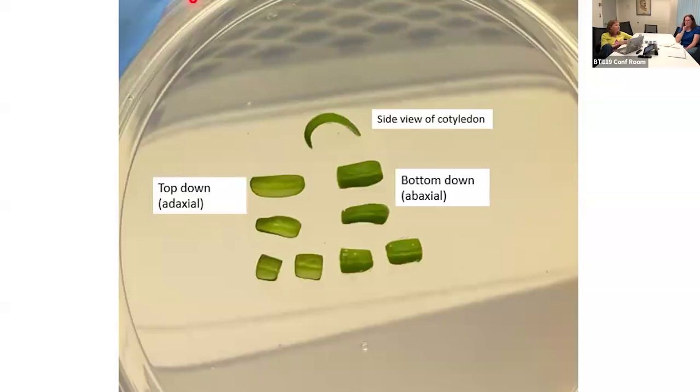One of the questions that got sent in had to do with blot drying the explants. I just wanted to mention that we really don't blot dry them, because that sounds to me like you are going to be damaging the cotyledons and taking off most of the agrobacterium.